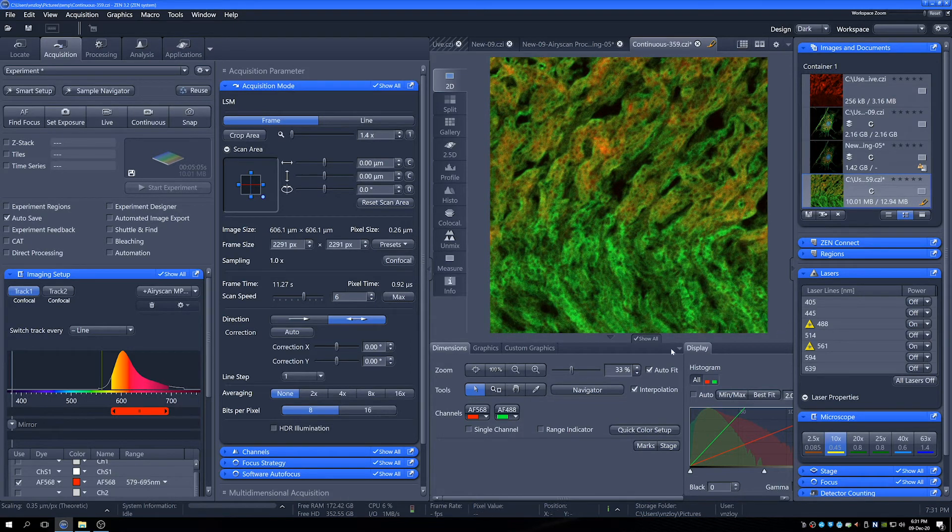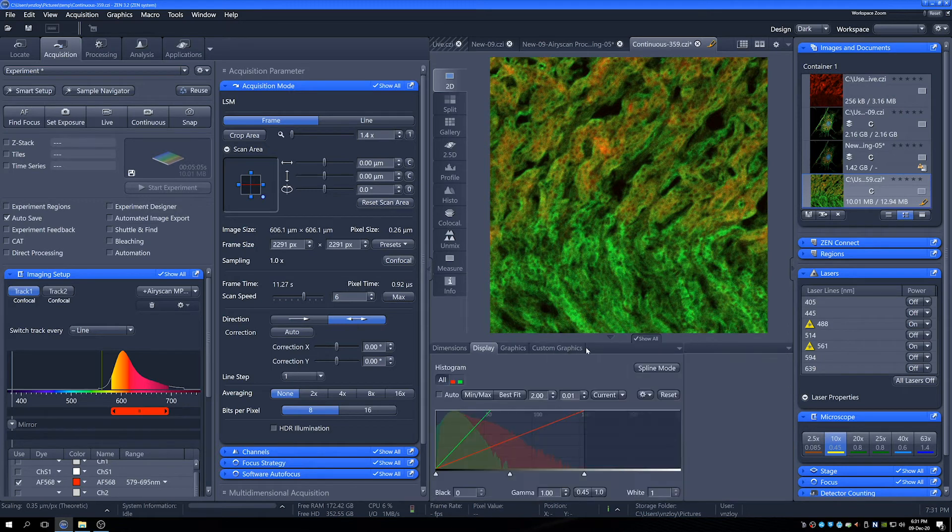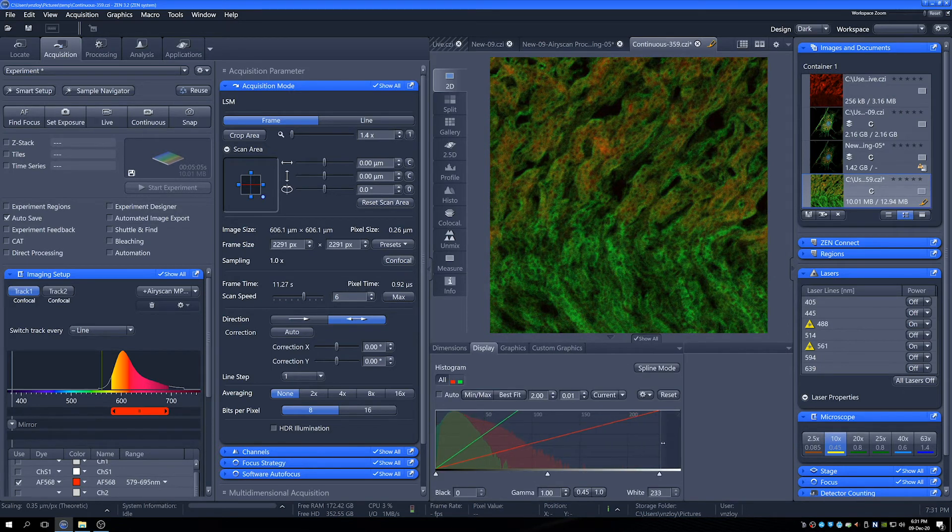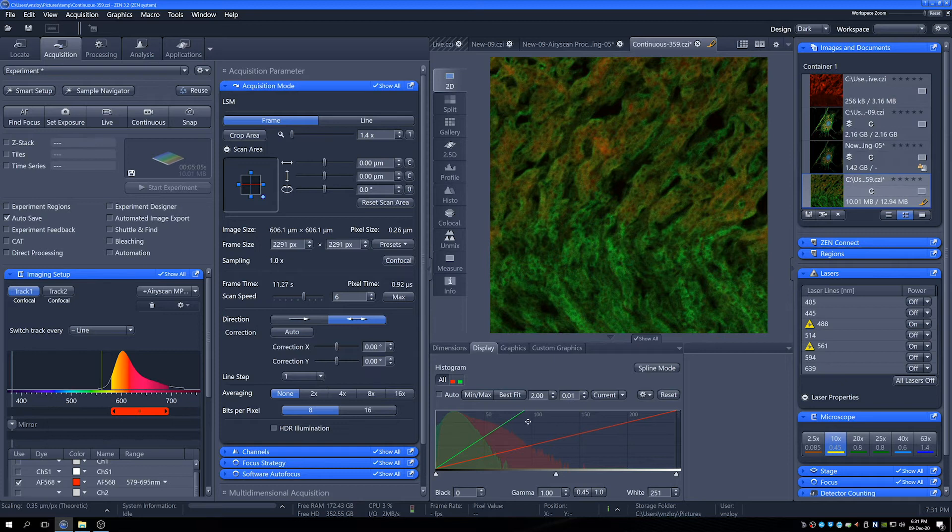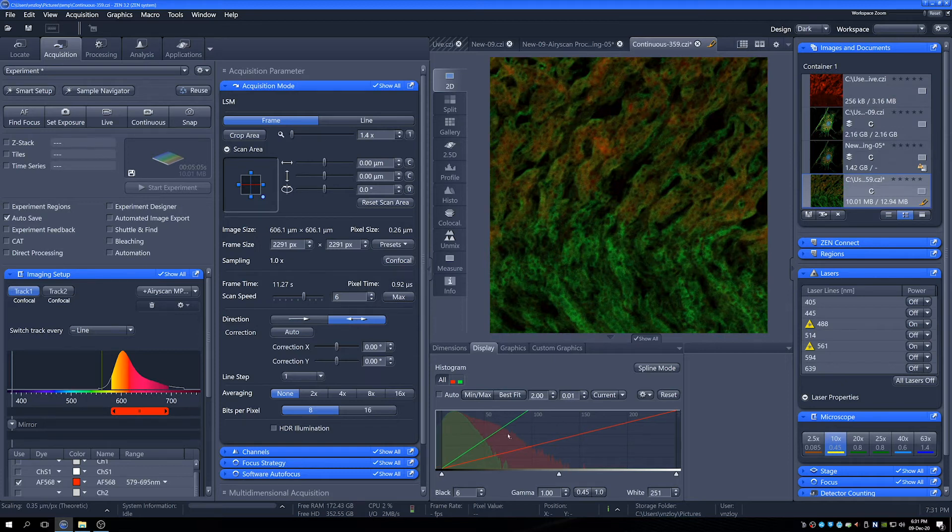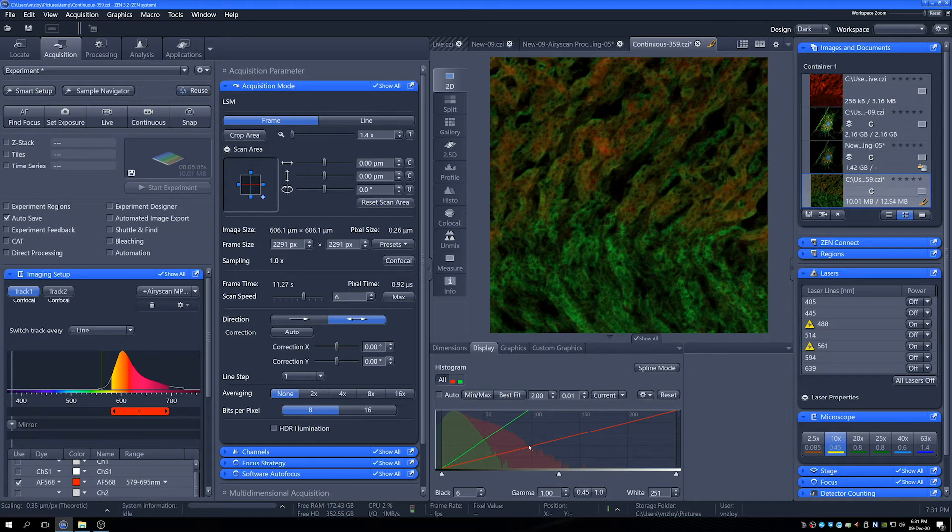I pull this display into here. And what I can do is we can have a little look at our histogram and see the level of detail that we're collecting, what our gray levels are like. At the moment, the green isn't particularly strong, but the red is okay in terms of strength.